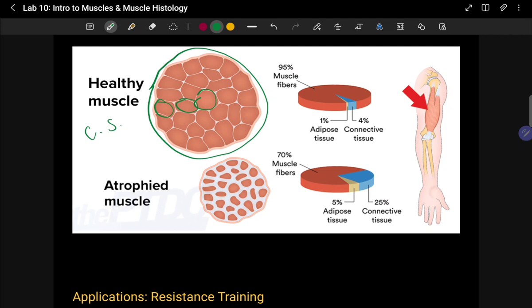We have a tiny bit of connective tissue, things like our endomysium, which is in gray here. Those are going to make up that about four percent of connective tissue, and then we'll have just a little bit of adipose tissue.